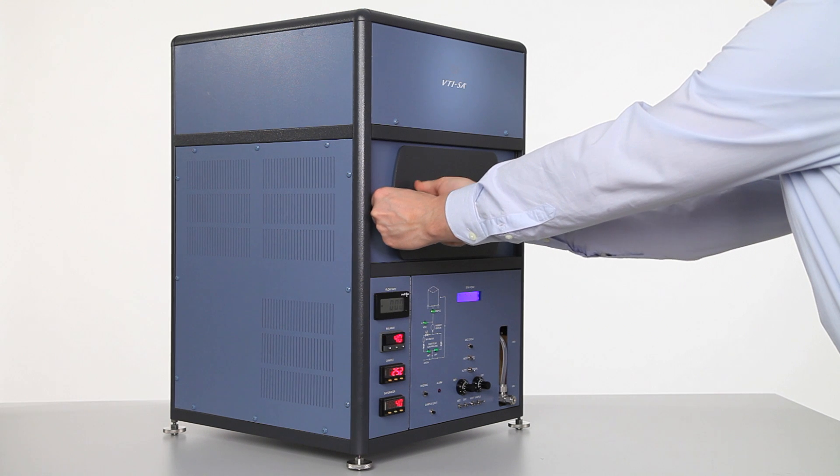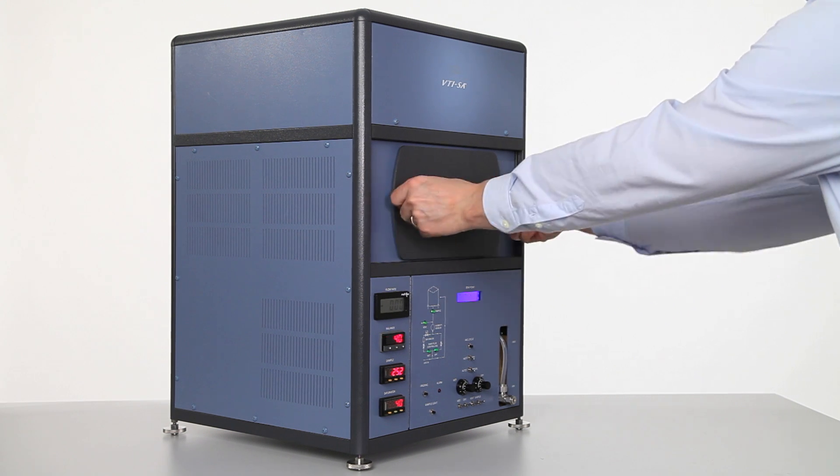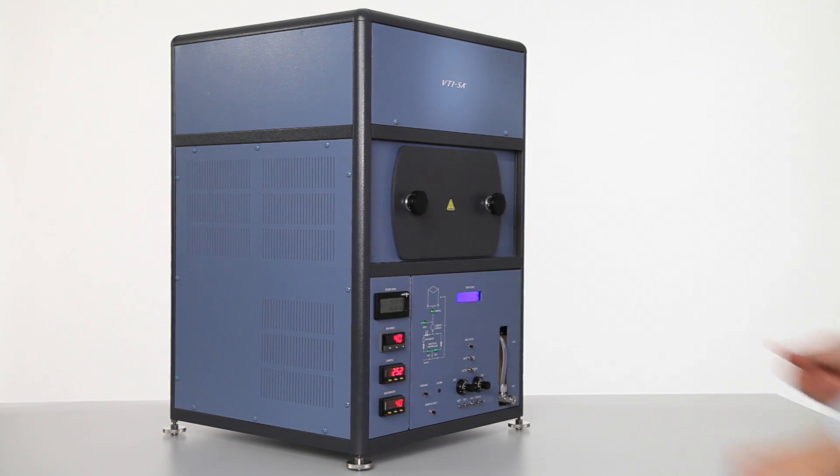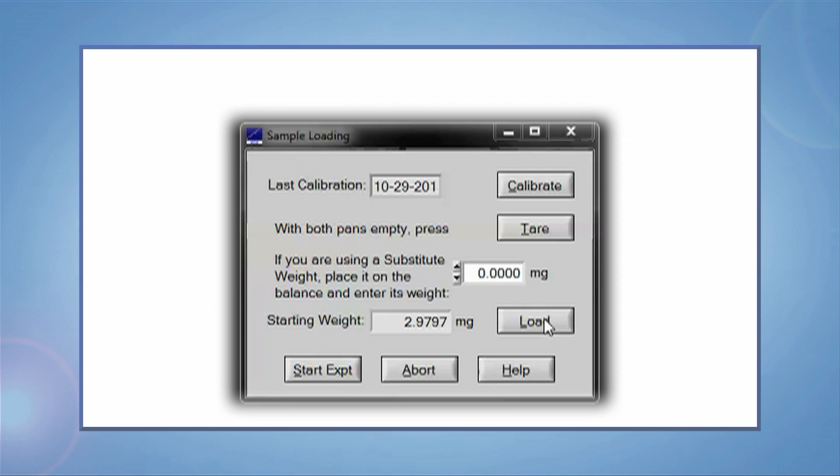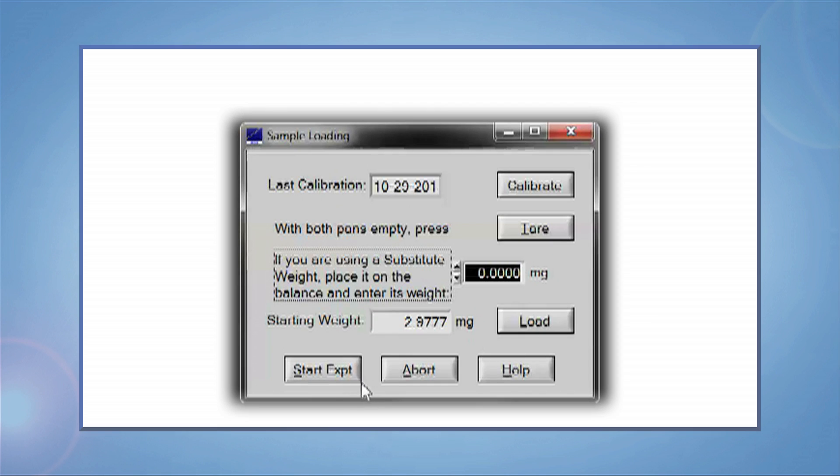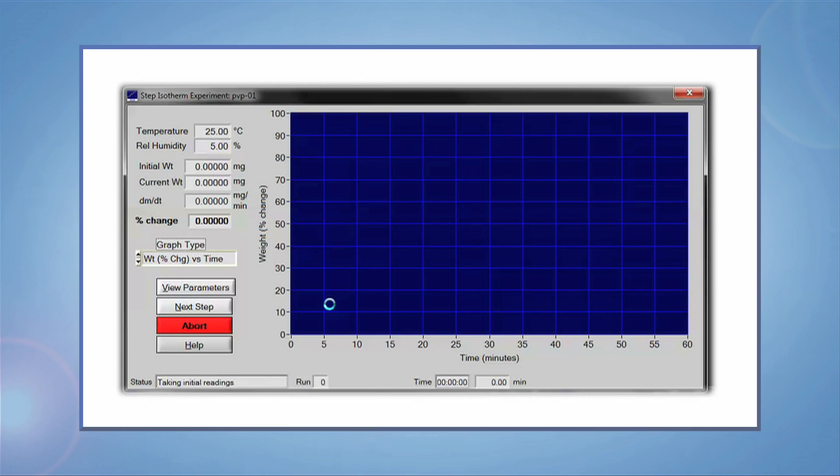Close the doors and allow the pans to settle for about 30 seconds. Then click Load. Then wait a few seconds and click Start Experiment.